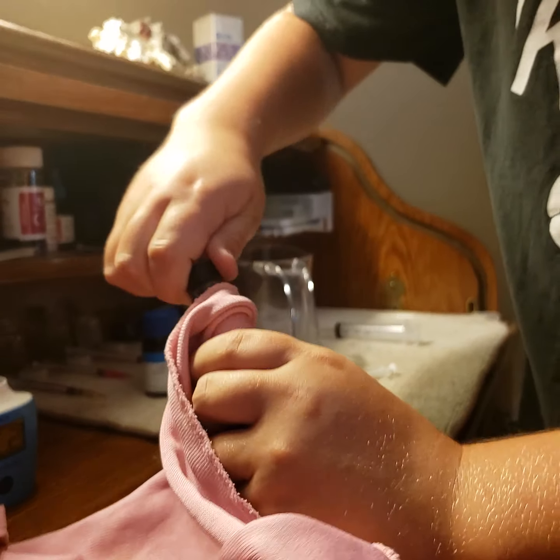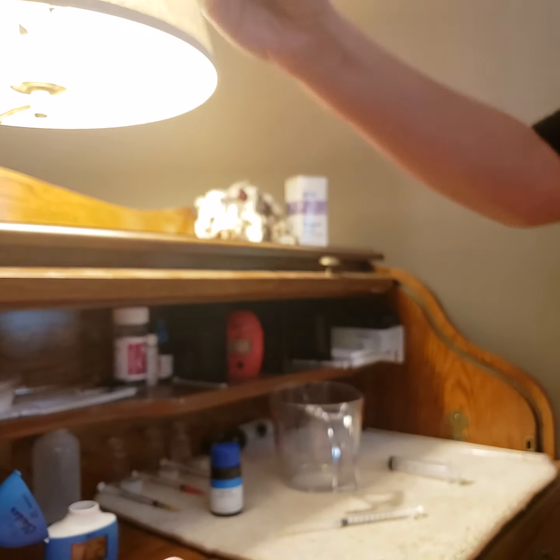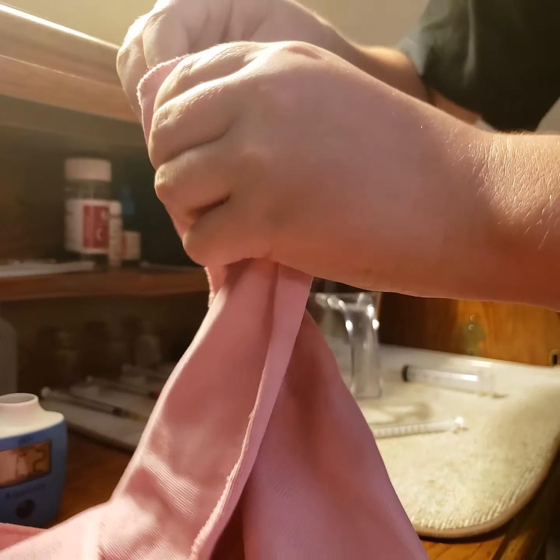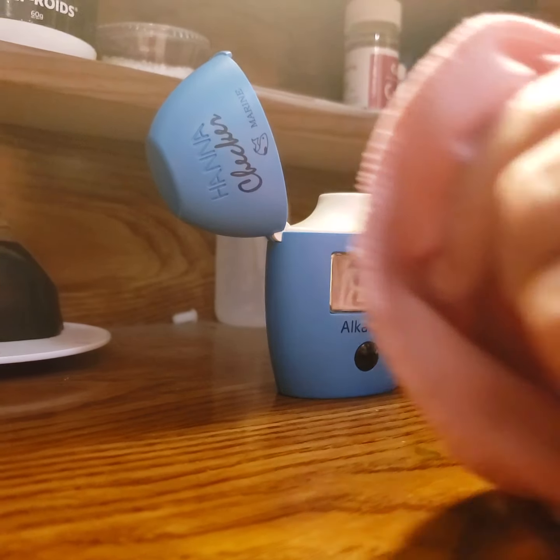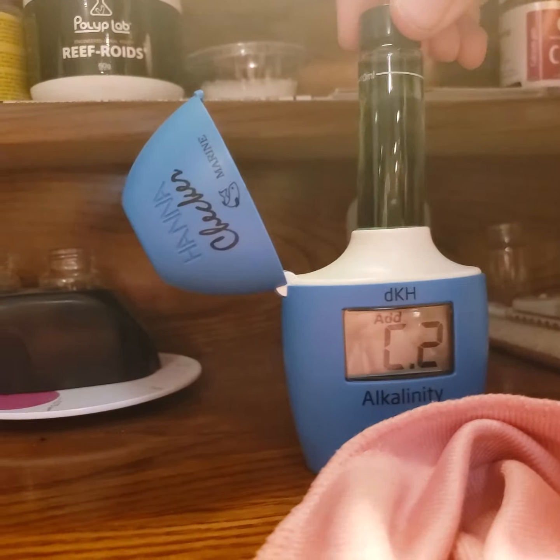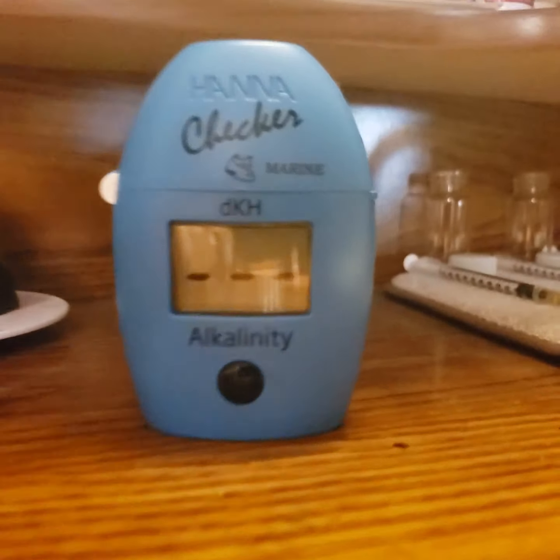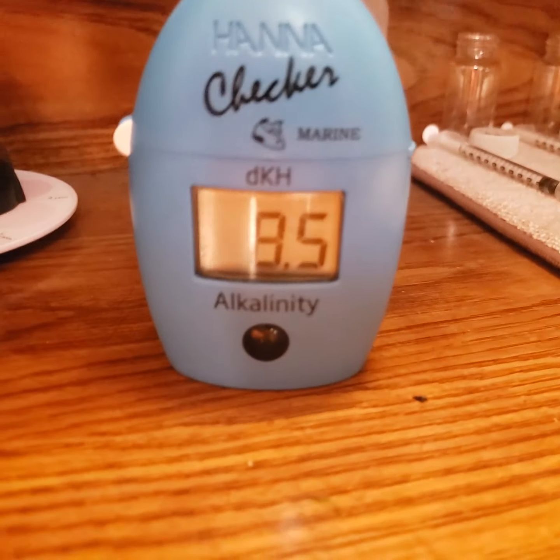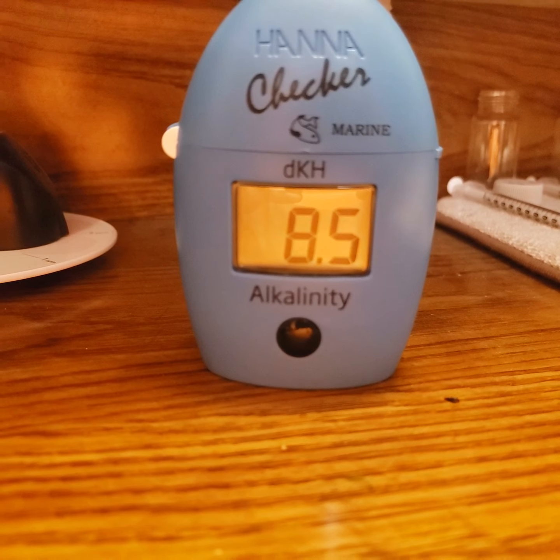Now he's gonna invert it 5 times. It doesn't mean shake it, it just means tip it over. 1, 2, 3, 4, 5. Now he's going to wipe off any fingerprints that may still be on it. And he's going to put it back into that little blue container called the Hannah checker. Sticks it in, closes the lid, presses the button, and then we'll get the result. 8.5. So you would send a text to me or Scott that says alkalinity or ALK is 8.5.